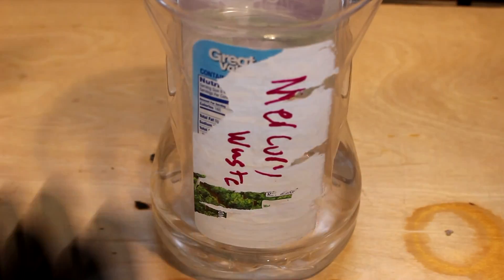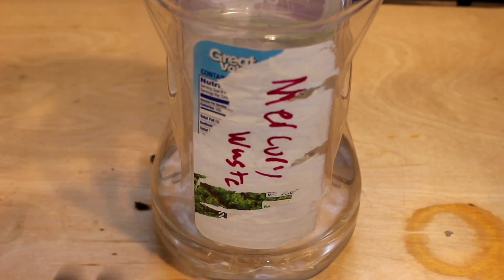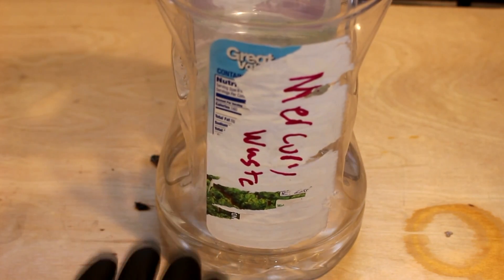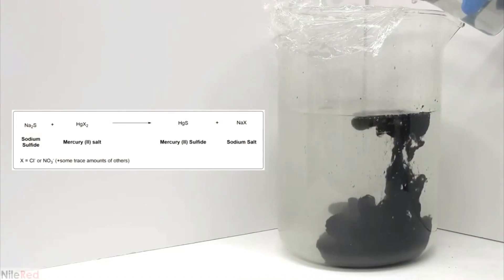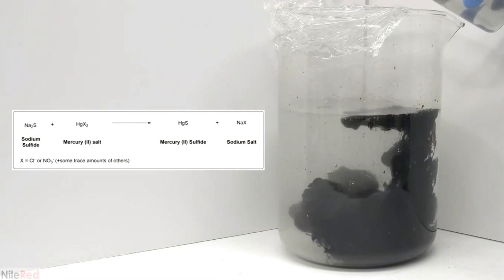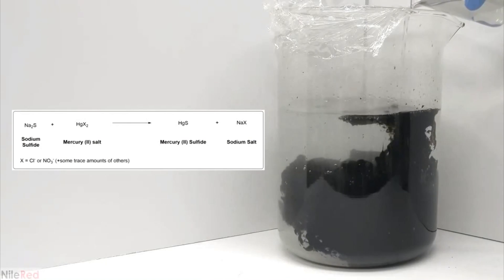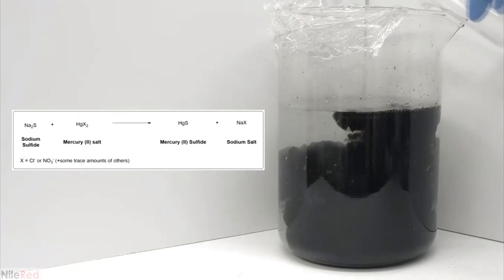This video is actually inspired by a video that my friend Niall Red did when he was doing something very similar. He was treating his mercury waste into a form that was less toxic. He converted it into mercury sulfide which is fine because mercury sulfide is a naturally occurring mineral. It's incredibly insoluble in water and not very toxic in that form.